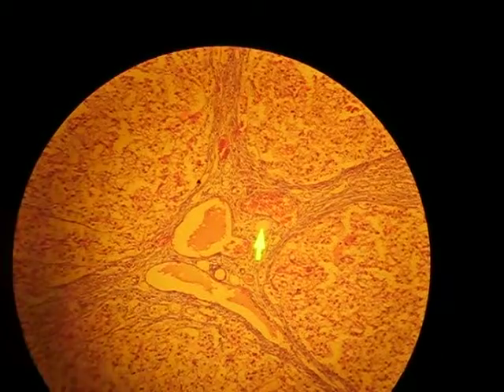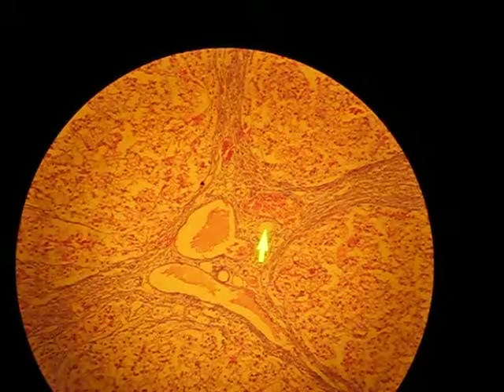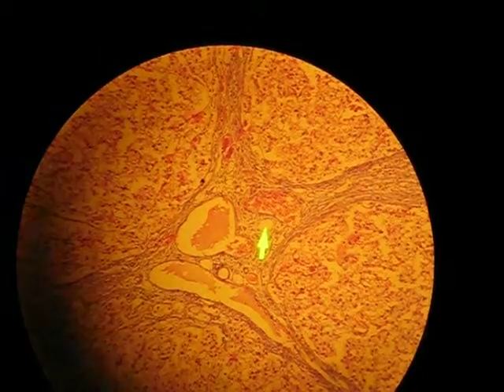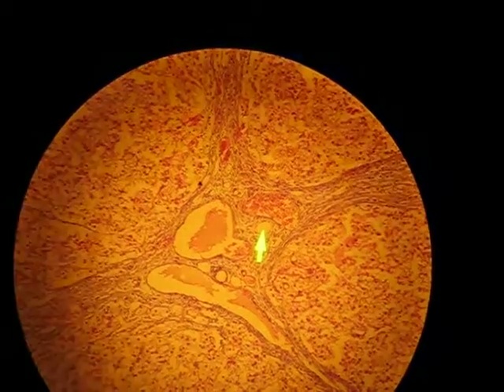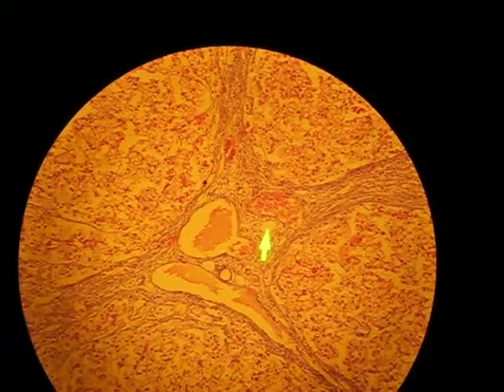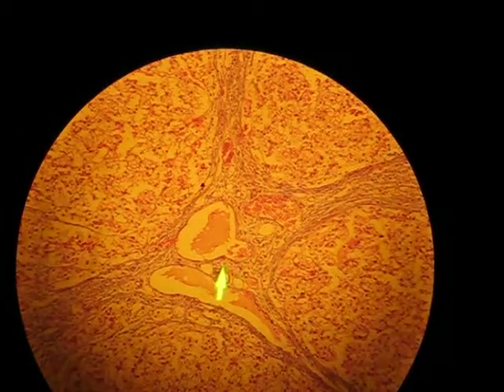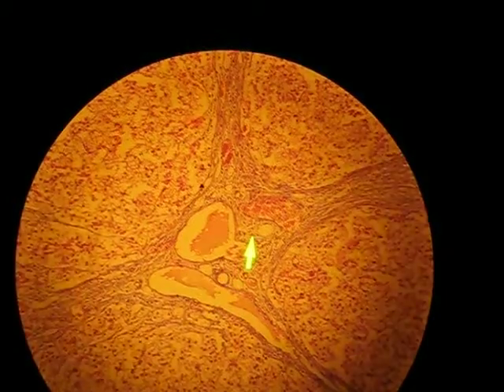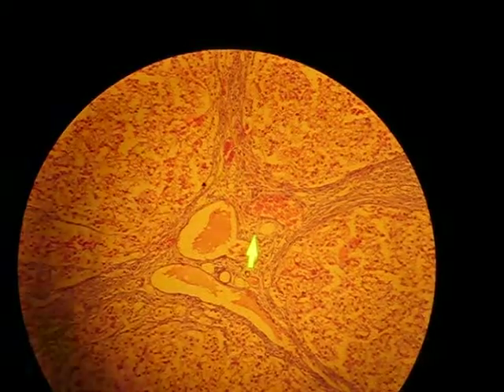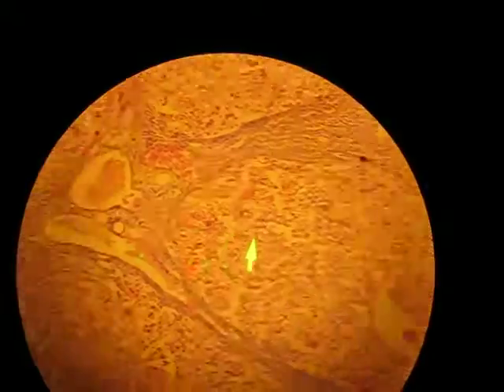Okay. So ductules. They're going to have more cuboidal epithelium. I want to see a better one than I'm seeing here. I want to see one that's obvious. You know there's got to be one here, right? Somewhere? Okay. I'm not going to stress. I'm going to move so we can find a good one. Okay. Can I do that? Yeah, totally. Okay. So I can't find the thing.